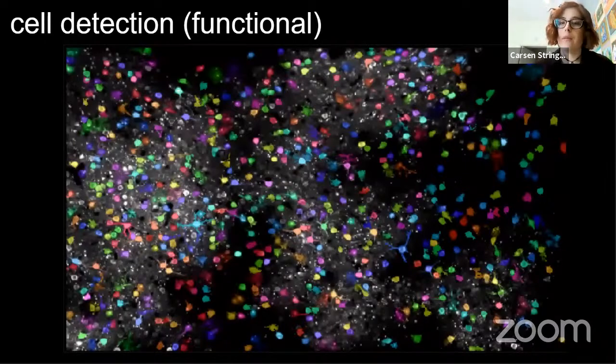which means that you might not be doing the best job of correcting the neuropil for a cell. Depending on the data, you might find that in CNMF the cells are more correlated to each other because there's more neuropil signal inside of them than there would be if you subtract off the neuropil the way we do, which is basically we take an annulus around the cell and use all those pixels as our neuropil trace, rather than using a couple of neuropil traces for the whole field of view.